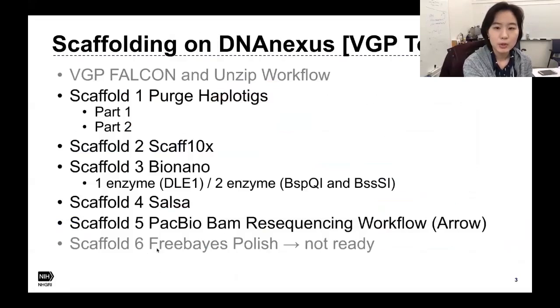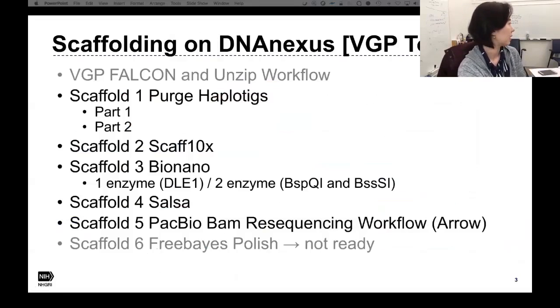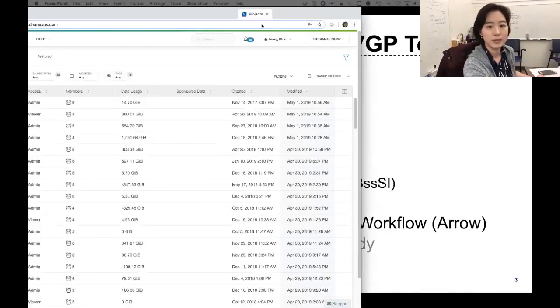When you go to the VGP Tools project on DNA Nexus, actually I can pull that web page. Okay, I got logged out. All right.